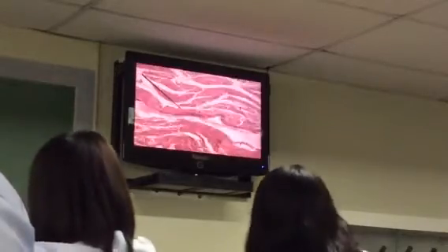So you have 3 layers. You have from here up to here, that would be your endocardium. And then this one, where you have your cardiac muscles, naalala ninyo sa muscle tissue ninyo, this is your myocardium. So, aaralin nyo ulit yung cardiac muscles ninyo. And then, after your myocardium, the third and the outermost layer will be your epicardium.